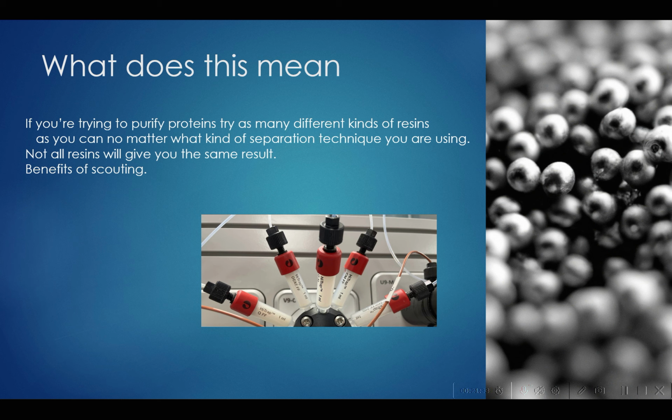If you're struggling to purify a protein or some other kind of biomolecule like DNA, it can often be helpful to try different resins with the same kind of ligand. Going back to our earlier example of ion exchange, like the Q column, right? It'd probably be better to try another kind of Q column, one that is higher pressure, non-porous, and has a smaller bead. Conversely, if you were doing preparative chromatography and you want to purify more protein, it may be better to go with a resin that has a more porous nature and is easily able to scale up.